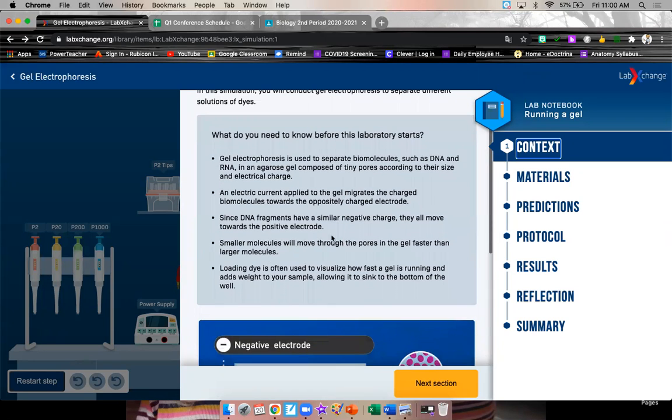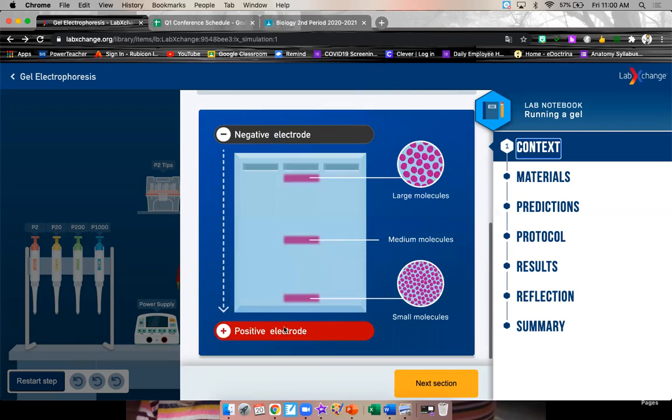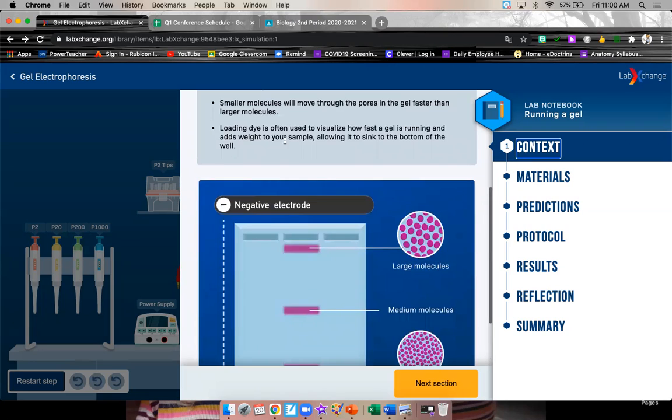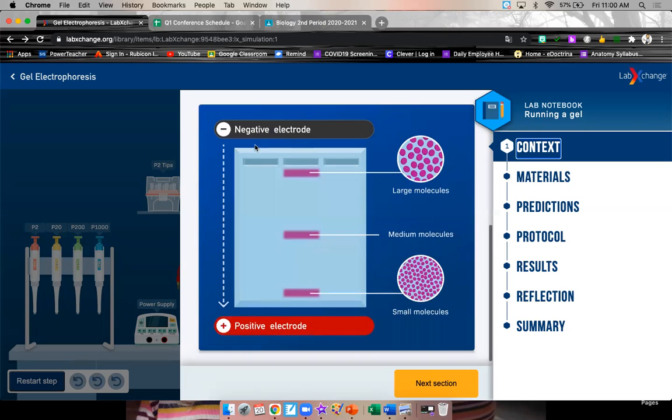Smaller molecules will move through the pores in the gel faster than larger molecules, allowing the smaller ones to go further. Loading dye is often used to visualize how fast the gel is running and adds weight to your sample, allowing it to sink to the bottom of the well. So the purple dye helps it stay in the well when we want it to, and it helps us see it. Alright, so that's what we're going to do. We're going to set up a virtual version of this gel. We're going to put in three samples of DNA, and we are going to run them next to each other.